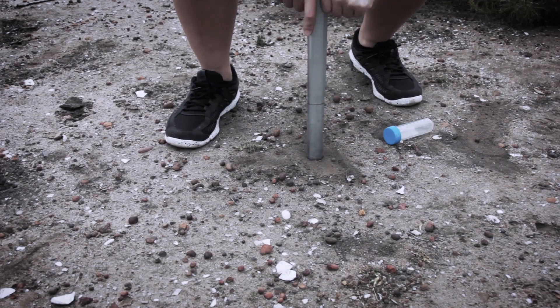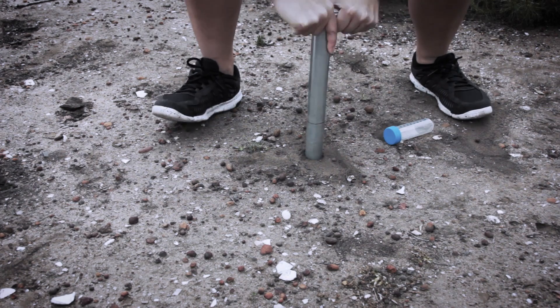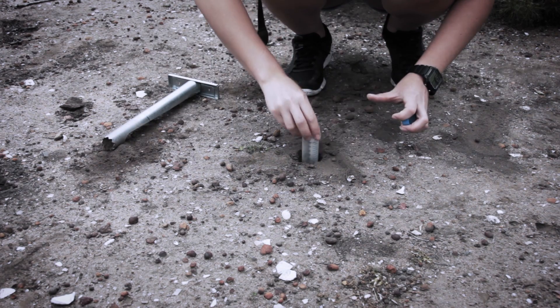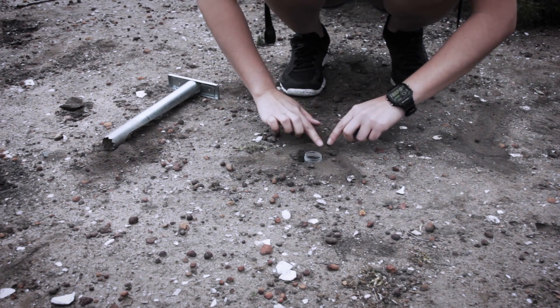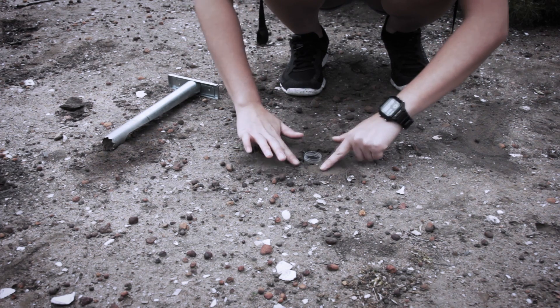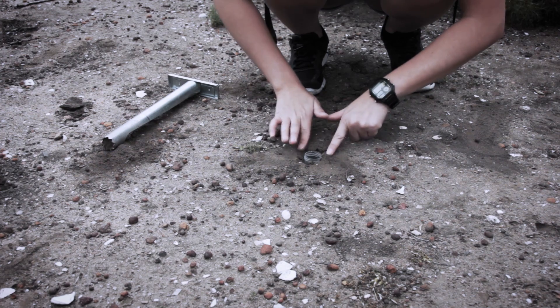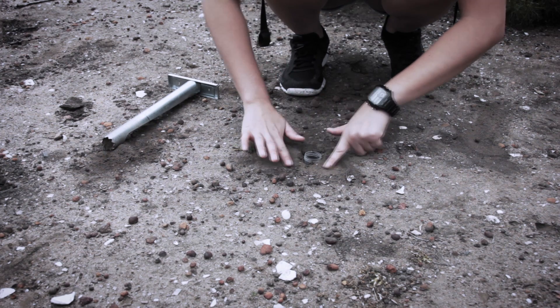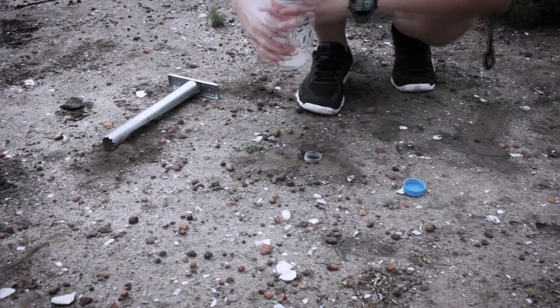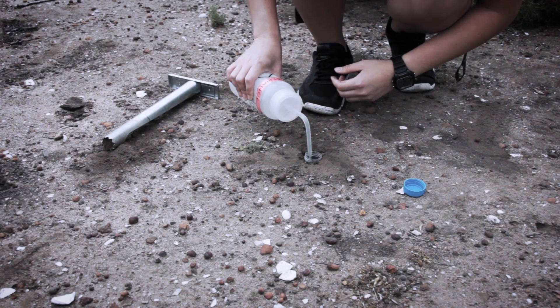Pitfall traps are used to catch ground-dwelling insects. Sink any sort of plastic jar or vial, such as a 50-milliliter falcon tube, into the dirt so that the top is level with the ground. Fill with a preservative, such as 70% ethanol, and leave overnight. Ants, bristletails, beetles, and others will be trapped.